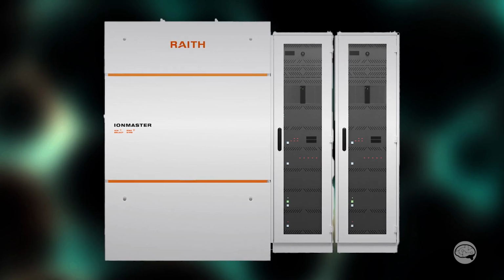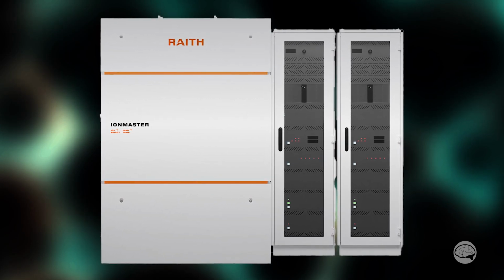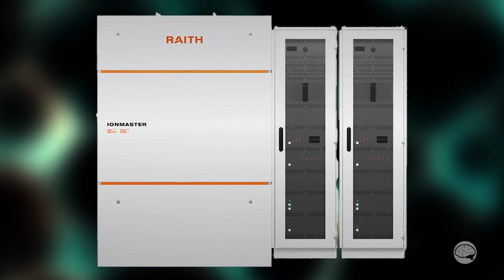So yeah, I understand the benefit of an ion microscope is that the ions travel at smaller or shorter wavelengths than electrons do. And so even though the ions are much larger, you can get better spatial resolution in an SEM type thing. Is that correct? Or am I making things up? It's both.